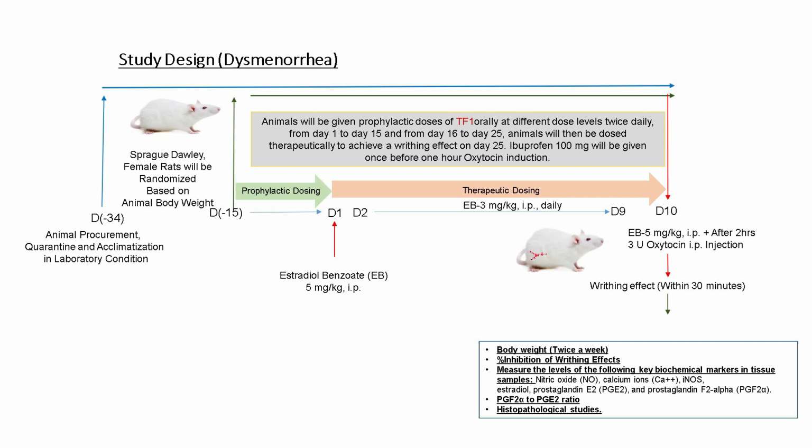Now we will see the study design here. Before the experiment starts, we have to procure the animals. It takes around a week or sometimes 15 days. Accordingly, I have taken a week for the purchasing of the animals, and then the quarantine time is 7 days. It's fixed, and then acclimatization of 5 days. Then you can see the experiment we can start.